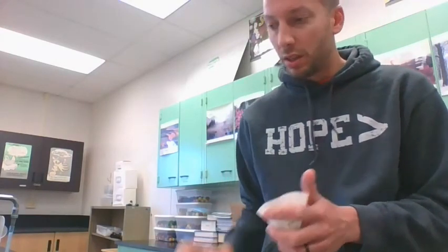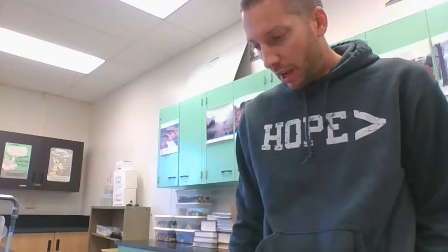I do think on this lab we had big pieces of solid, so the filter paper caught most of the blue stuff. Remember, we just had water draining through. So 84% looks good. And that's the end of our copper hydroxide lab.